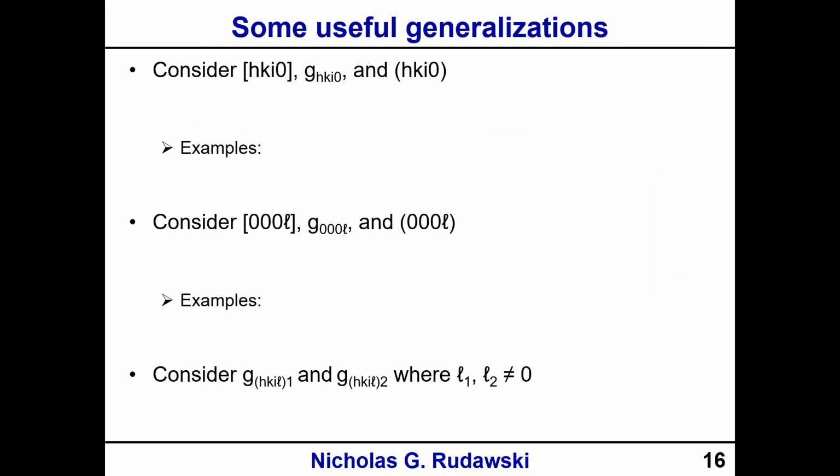So using these metric tensors, we can make some useful generalizations for the hexagonal lattice, to help us quickly analyze situations and get through the process of indexing.